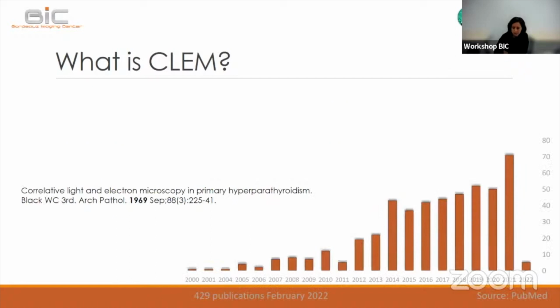So these methods have been developed for a while now. The first protocol I found is from 1969, in an article that was more dedicated to clinical research.